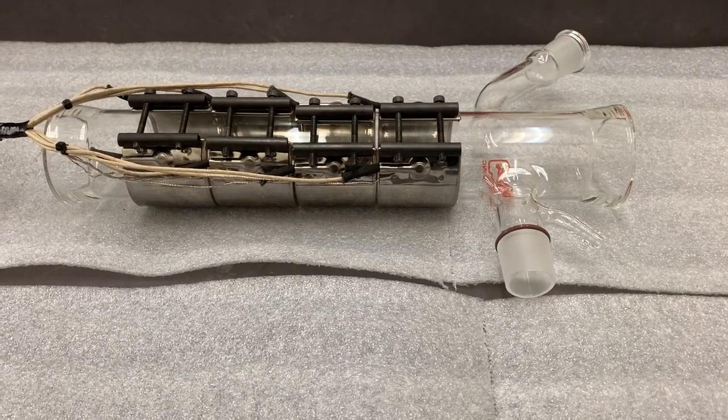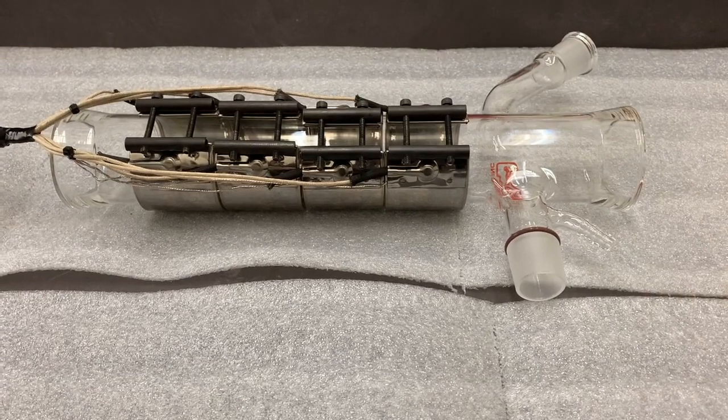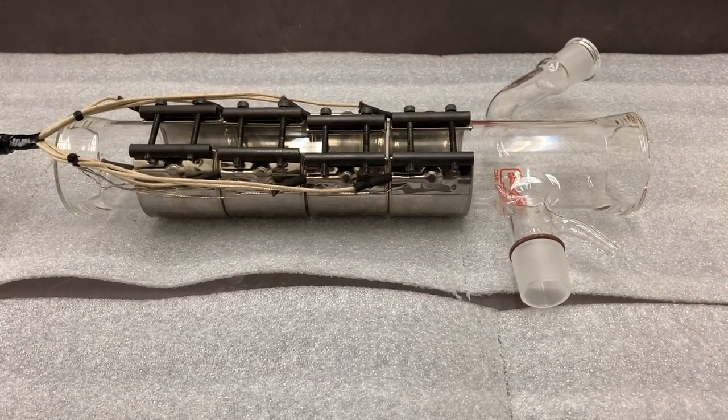Hello. Today we're going to be removing two-inch metal band heaters from a Pope distillation system.